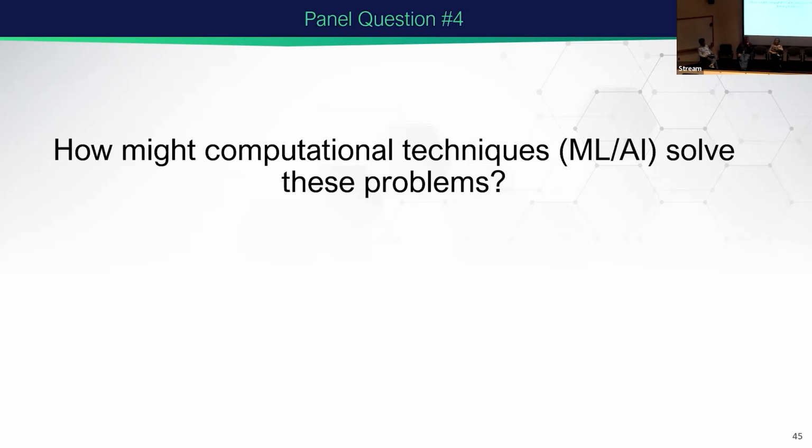So if you can feed all this information to it and say, this is the region I'm interested in, this little tiny micron region where there's something going on that I care a lot about. Who's there? What are they doing? And what are their partners? Who also is in high amounts, who's actually being depleted. So that's the type of information that we want to get to in the future by using advanced approaches. And it saves time and we can get through it a lot faster.